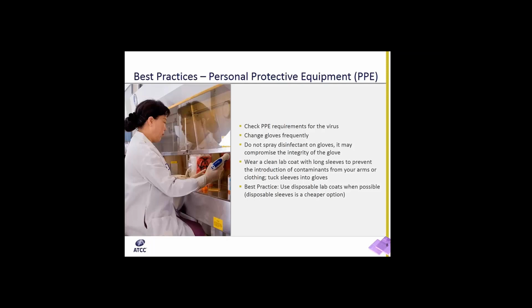Do not spray disinfectant on the gloves, which we find is a common practice with people, because this actually will compromise the integrity of the glove. We find our best practice is to use disposable lab clothes when working with viruses. And when possible, because these are quite expensive, disposable sleeves are a cheaper option for people to use.